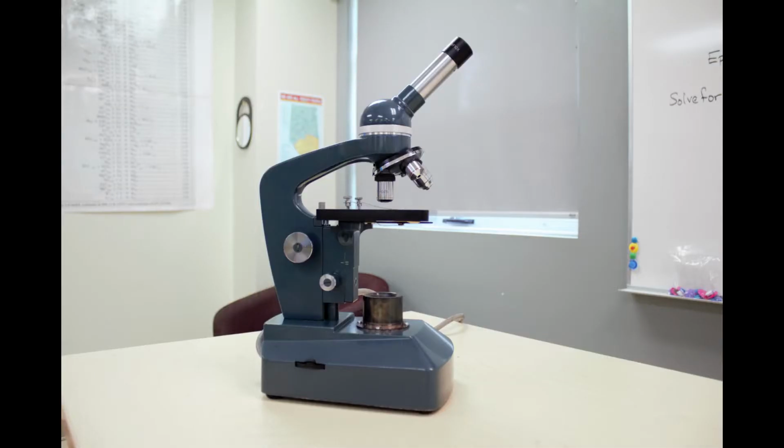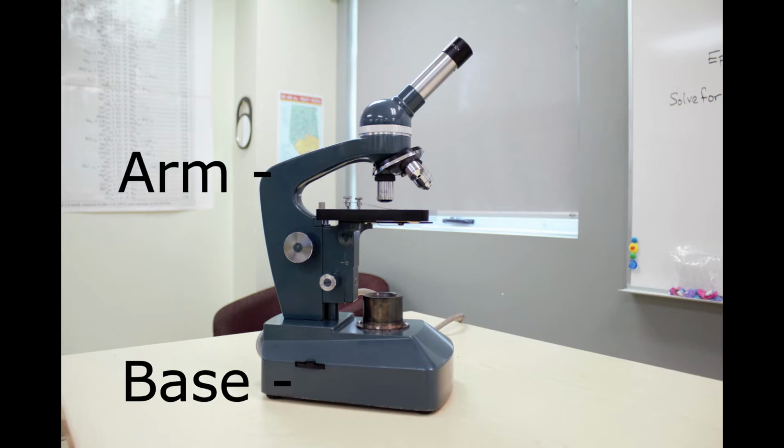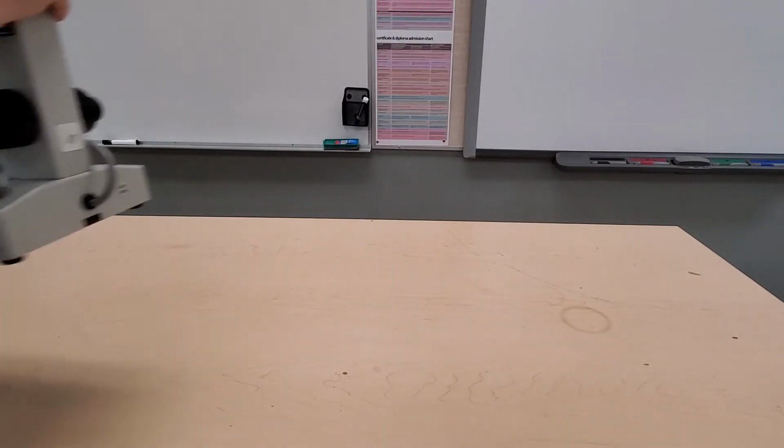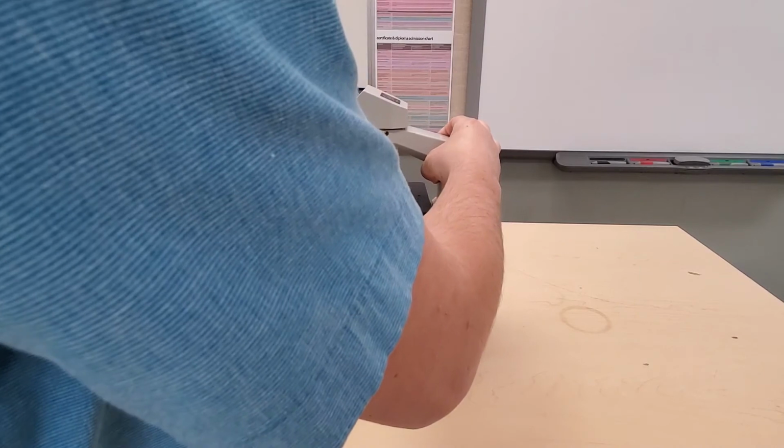When we grab our microscope from the side benches, it's really important to lift the microscope only by the base and the arm of the microscope. These are the sturdiest parts of the microscope, and they're made for you to be able to hold the weight of the entire microscope without damaging it. Let's go ahead and plug in the microscope, and we're going to turn it on as well.